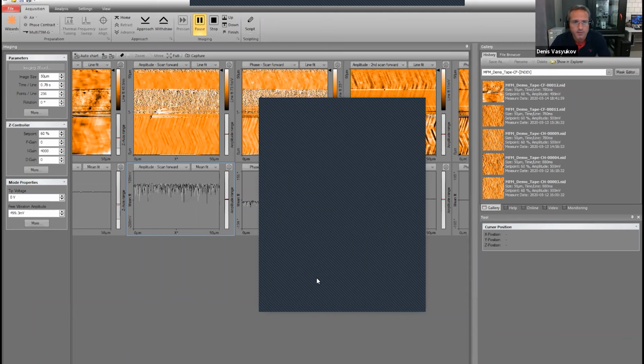So you know that back in the days, people used to store data on magnetic tapes and disks. That storage didn't need any extra energy to stay magnetized. This data was stored indefinitely. So this is the kind of sample we're measuring now. I hope the tip doesn't magnetize the sample. Otherwise, we would see strong artifacts in the magnetic signal, and we don't see them. So in this case, the tip does not magnetize the sample.